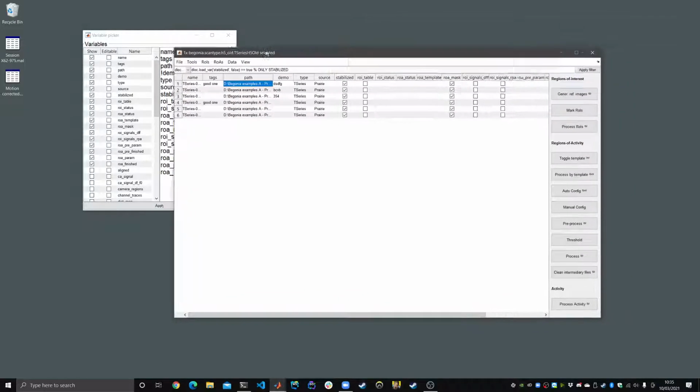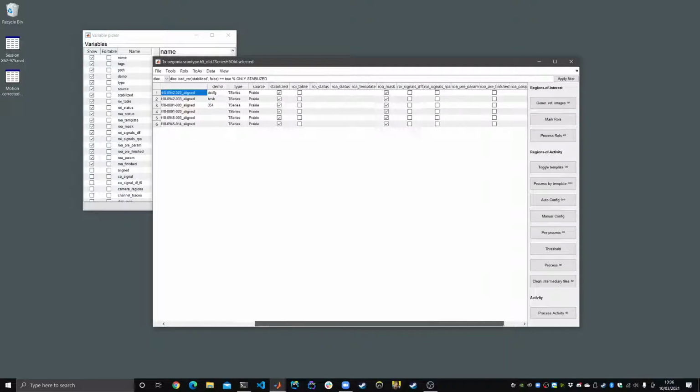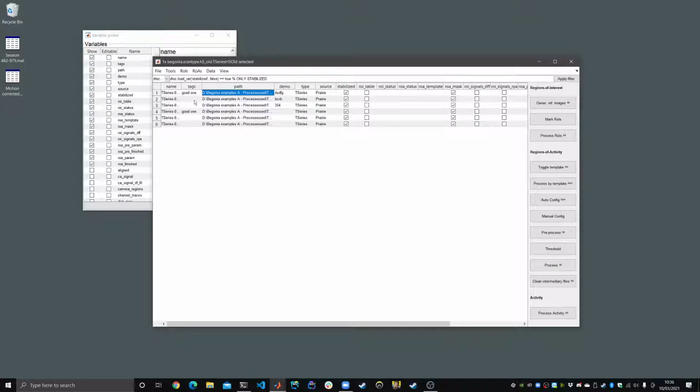One important thing to note about this is that using the data location mechanism, effectively you need no setup. The mechanism itself will create a metadata folder either inside the folder that you are pointing at, if it is a folder, or if it's a file, then it will create a metadata folder adjacent to that file that will contain all this additional metadata. The way this has practically worked is, for instance, if you do a marking of regions of interest, then it will save that table of regions of interest into the metadata structure. And basically configurations and derived data, all of that goes into this metadata directory. So we find this mechanism to be very, very useful and practical.